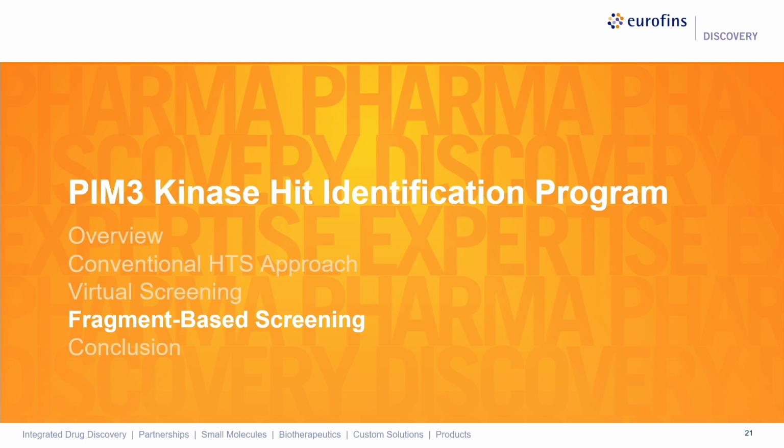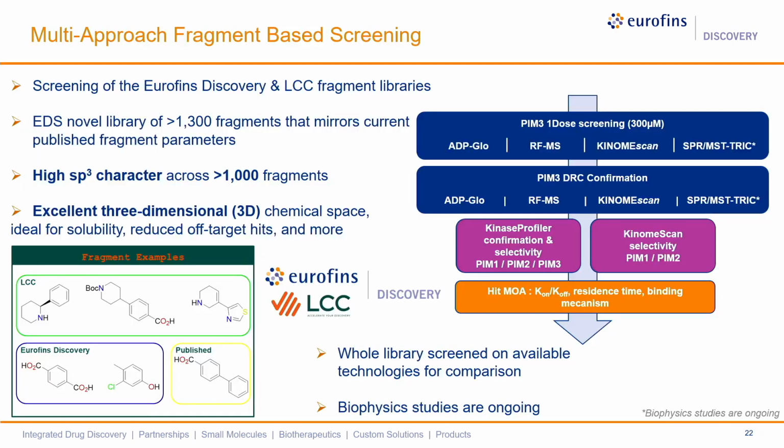And then to finish my part, I will take you through the fragment-based screening. And not as a surprise, we combine the same technology, ADP-Glo, mass spec activity assay, and we use our binding platform, the kinome scan, to look at the binding of the molecule on the kinase. Also, what is ongoing, it's the biophysics, and as for the virtual screening, I don't have the data yet.